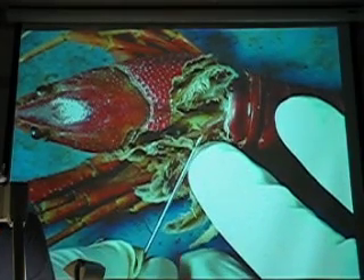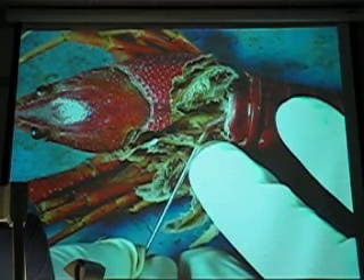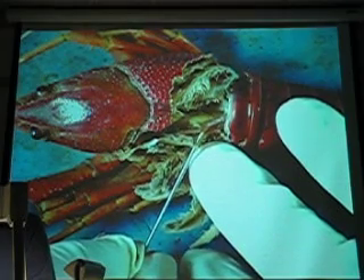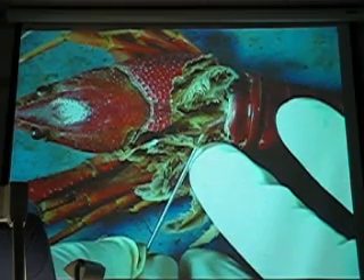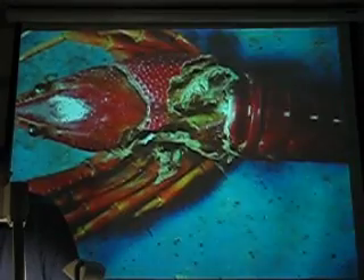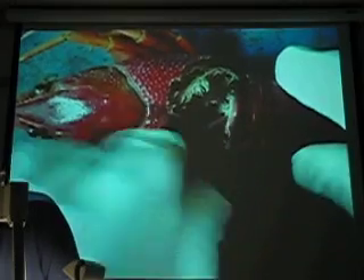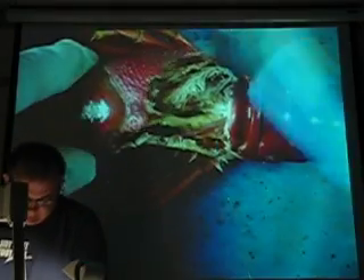Bustle? It's connected to the abdomen. Abdomen extensor. Not long. Excuse me? He would not like it if he were alive — he would not like it at all. I would have gotten bit by now.